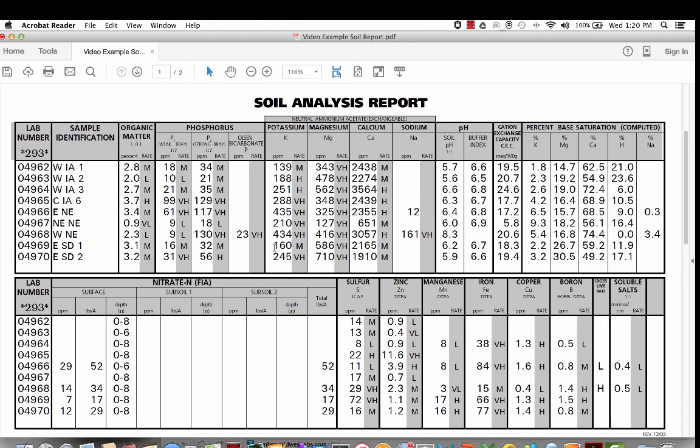The first South Dakota soil here, we've got 160 part per million. Soil's kind of medium textured here, looking at this 18 CEC. So we'd like it to be a little higher than that on the potassium results. So we'd be shooting for a recommendation to both build soil test levels a little bit and also replace crop removal. And then the last sample here at 245 part per million. Again, fairly medium textured soil.